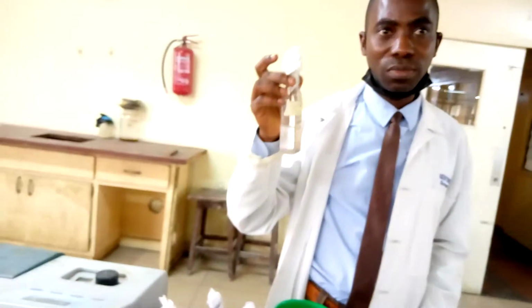From this, we can create what we call a serial dilution. In biochemistry, we try to work from the known to the unknown. So we start from a given concentration of what we know, an amino acid in this instance.